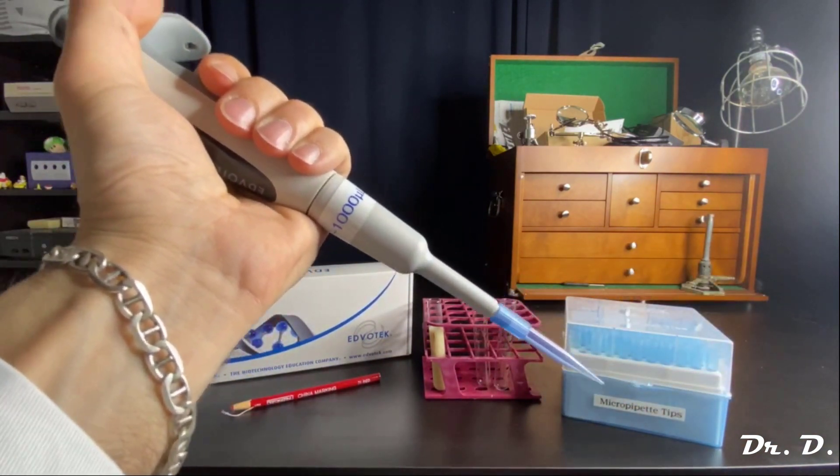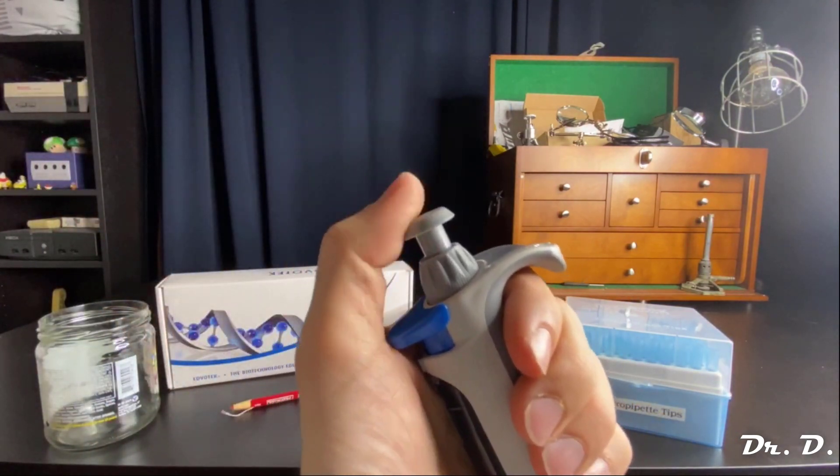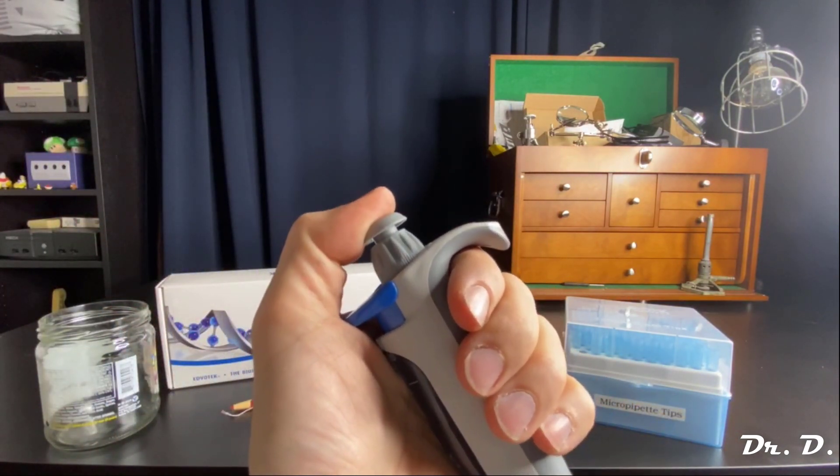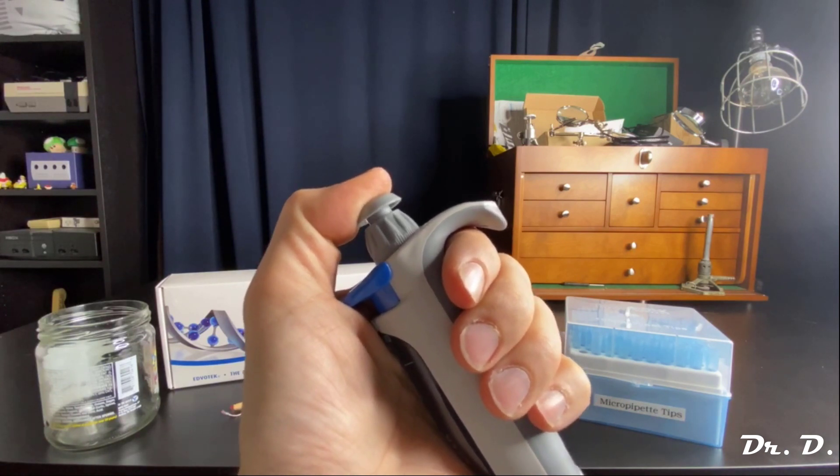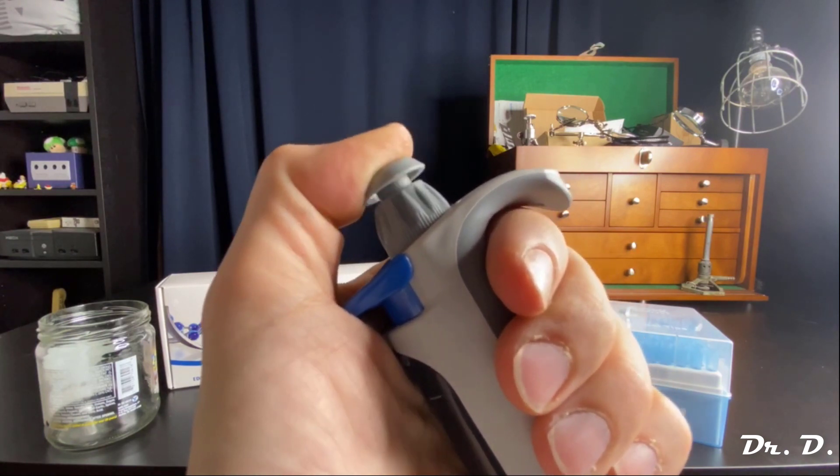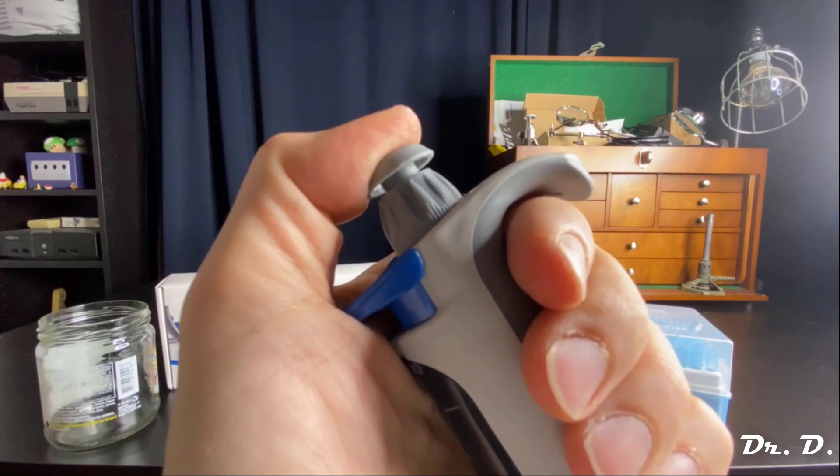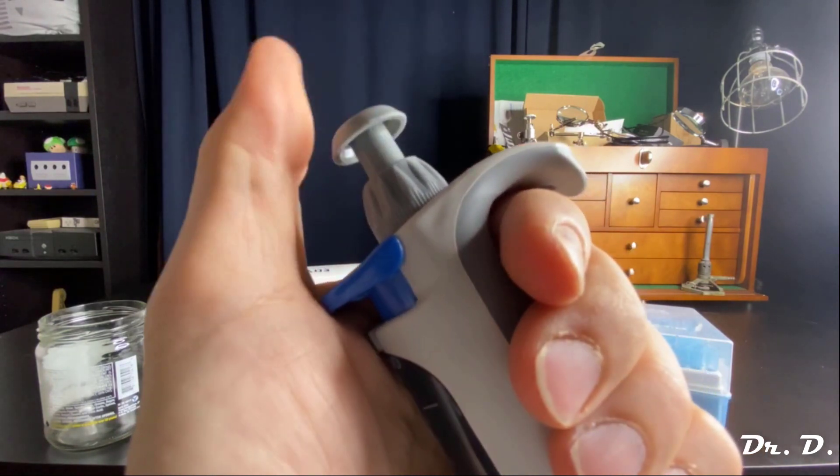Now here's the trick to pipetting. There are two stops on the plunger. Look at the plunger here. When I push, the plunger stops. However, if I push harder, watch this, it goes further. Did you guys see that? There are two stops. Stop one and stop two.